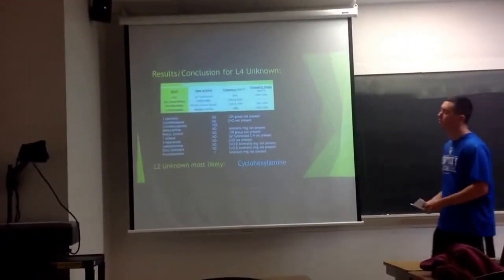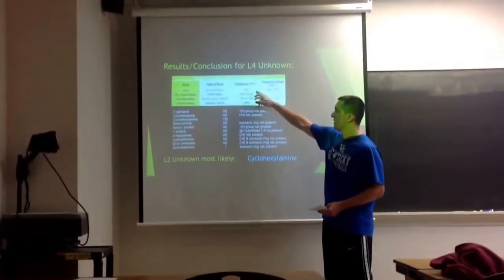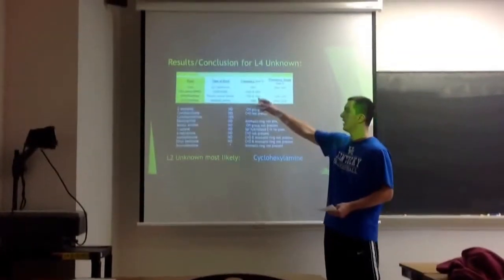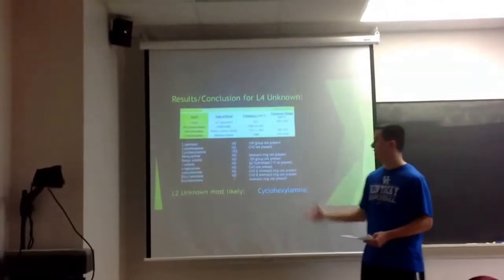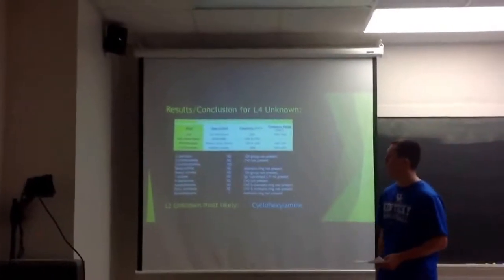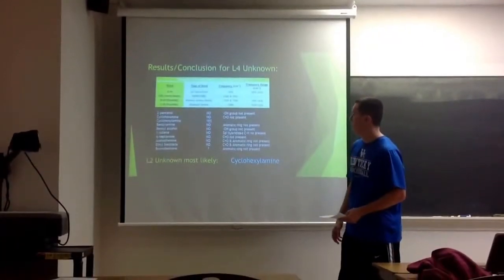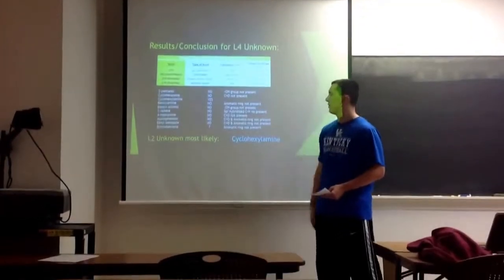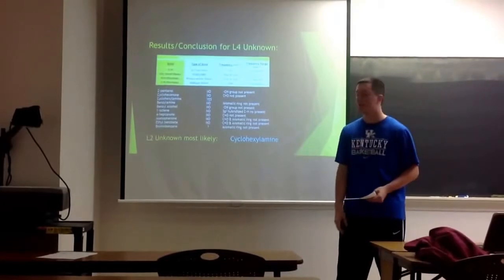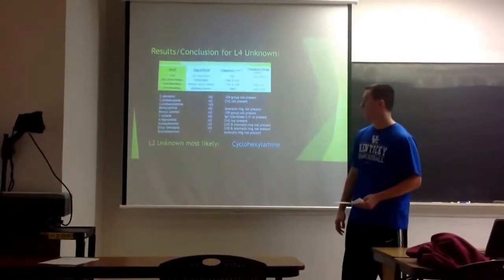And for L4, of course, the frequencies here are our sp3 CH, our disregarded CO2, and then a possible NH or CN bond. Of course, I have to look at the other molecules to see if any of them could be it. There's no alcohol group or carbonyl group in there. There's no aromatic ring, no alcohol. We don't see any sp2 hybridized CHs. The carbonyl and aromatic are not present again.